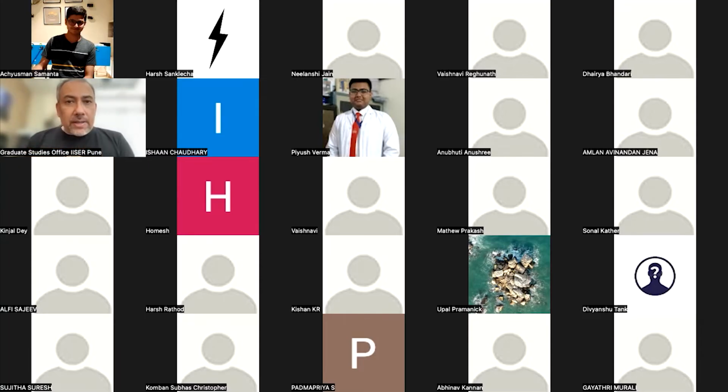Now, depending upon the resolution you have and the kind of staining that you use, you can also use DAPI to see structures inside the nucleus if you decide to. Right. Similarly, there are dyes that go to the plasma membrane, that go to the Golgi, to other organelles.